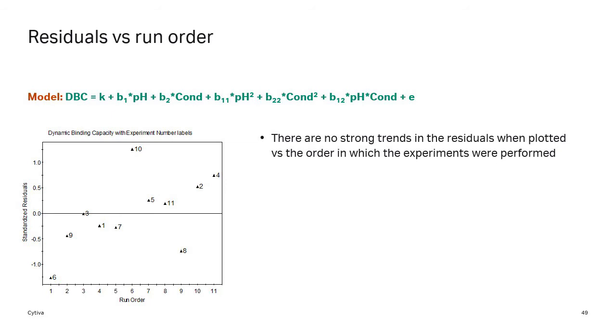If we graph the residual versus run order just to see if we have any strong trends over time or not, it seems that we do not. There's at least no immediately strong outliers. It's still not so many experiments that we would make any strong conclusions because this one is here and sort of ends up here. Overall, there is no big shifts or big trends. And also the evidence that the residuals are normally distributed is in favor of this not being over-interpreted as well.